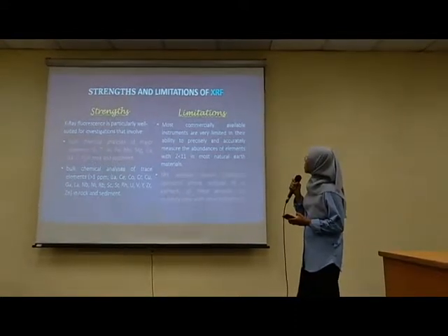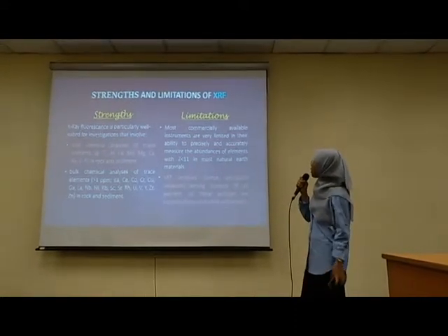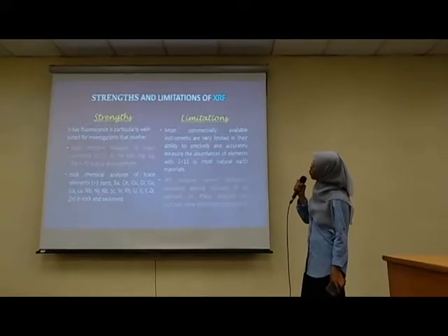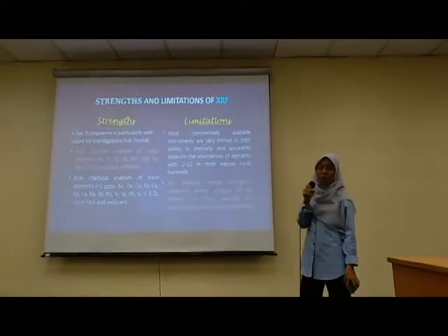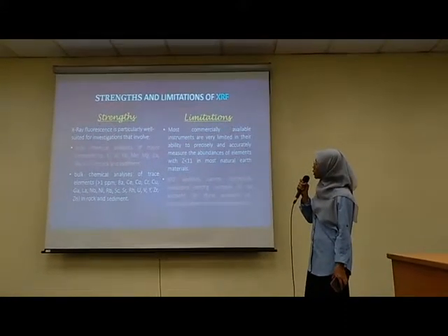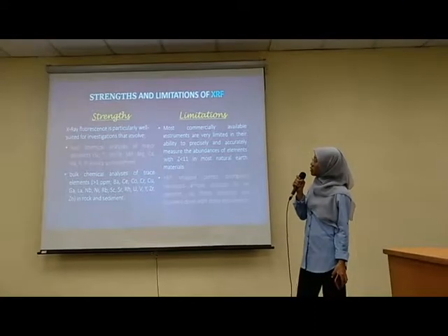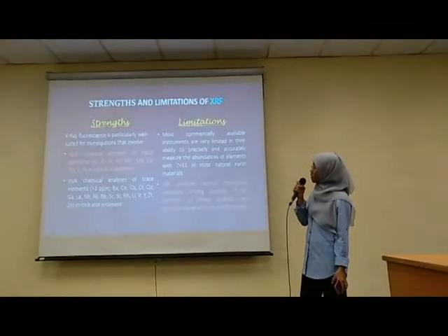Okay, next, the strengths and the limitations of XRF. The strength of XRF is that it is particularly well suited for investigations that involve bulk chemical analysis of major elements such as calcium, sodium, potassium, and so on.